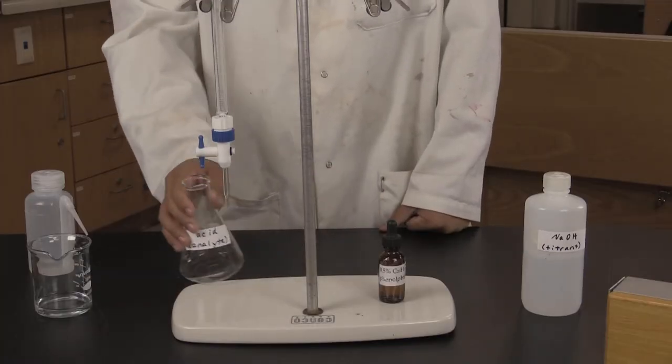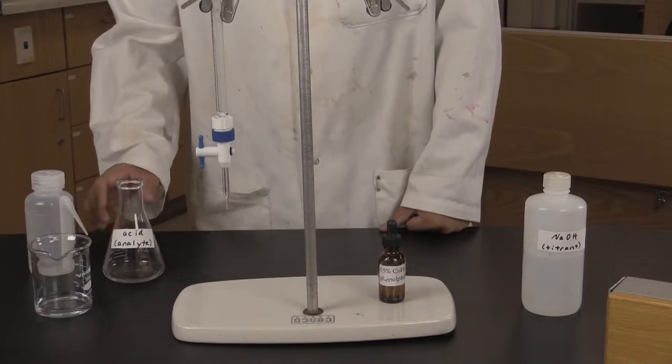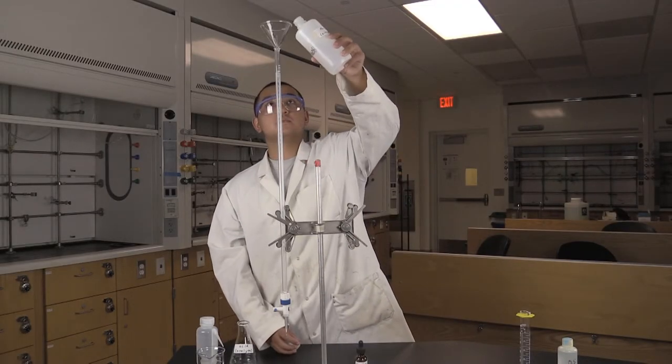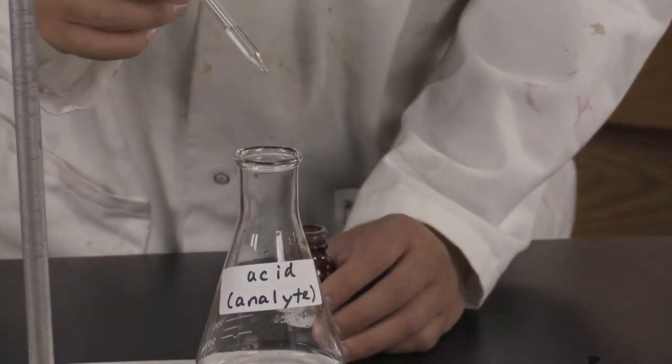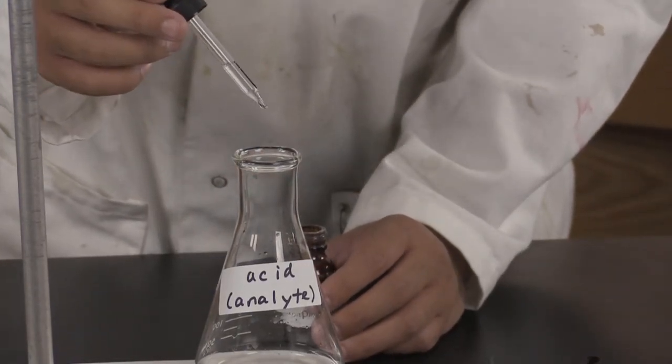Lloyd has already conditioned his burette, so he can go ahead and fill the burette with the titrant sodium hydroxide. Don't forget to add the indicator solution, or else you will titrate forever and not know where the endpoint is. The indicator solution changes color to tell us when all of the analyte hydrochloric acid has been neutralized.